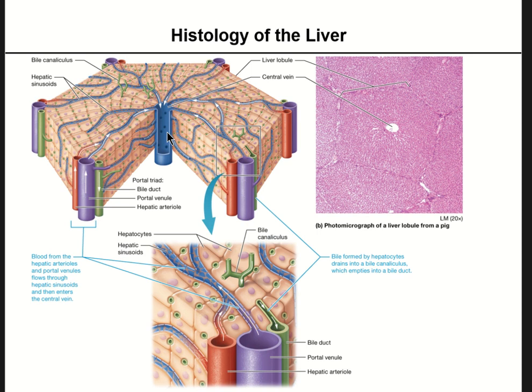and all the lobules are kind of stacked on each other. If you look back at those classroom models you worked on, the center of the lobule is going to contain a central vein. So it might look white here on some of these slides, but that's where your central vein is going to come through. Then you've got your corners of the lobule, and on each corner are these little clusters, and I like to think of them like a bunch of liver Chinese gangsters. It's your portal triad.